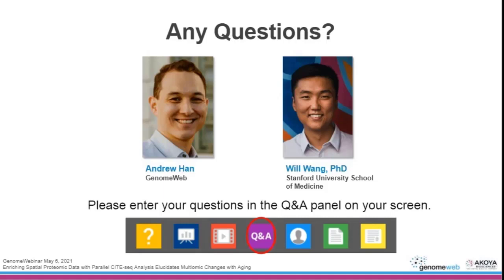All right. And if people are interested in learning more about SPACE or perhaps using it, is it publicly available? So SPACE is still in development, and if you're interested in collaborating with us, please reach out to me, and we can work on this, and we can try to analyze your data or put it through the algorithm. We're in the process of optimizing both the database and some of the math behind the algorithm still. But I'm happy to collaborate with people who are interested in getting a spatial understanding of cell-cell interactions and signaling.